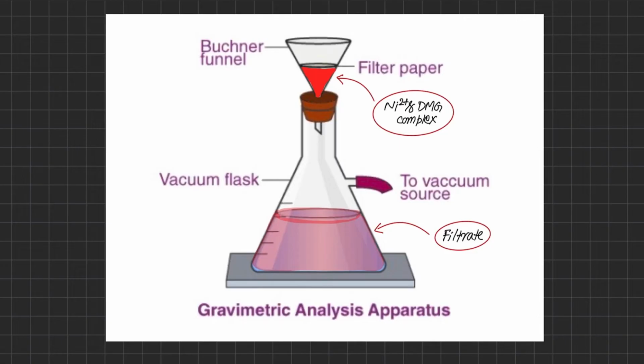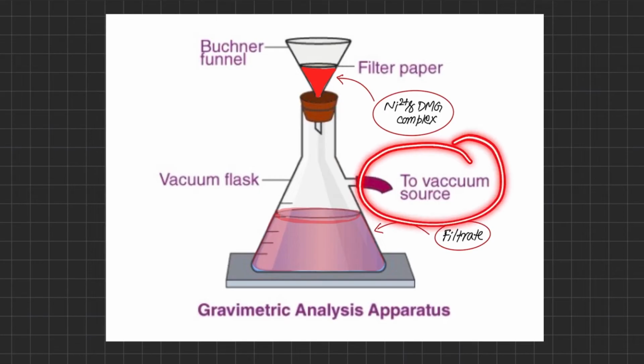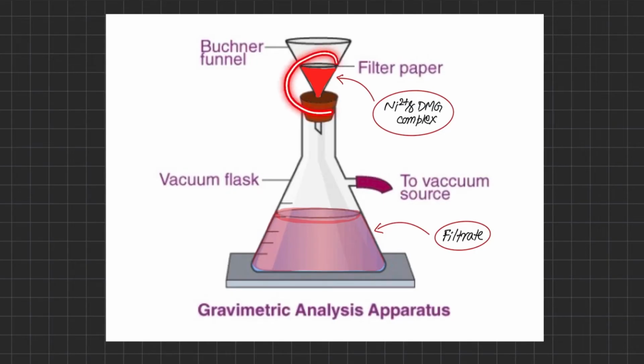In order to enhance the efficiency of the filtration assembly, we can use a filtration flask and attach a vacuum pump here, so that the filtration can be done speedily. In this place we can also fit a gooch crucible or filter crucible instead of filter paper, so that the whole filtration procedure can be performed in a quick way.